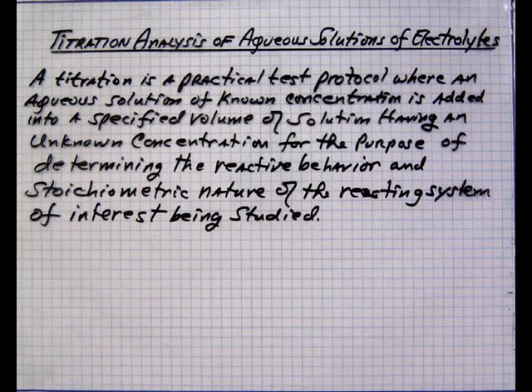Okay, this deals with the titration analysis of aqueous solutions of electrolytes. And a titration is a practical test protocol where an aqueous solution of known concentration is added into a specified volume of solution having an unknown concentration for the purpose of determining the reactive behavior and/or stoichiometric nature of the reacting system of interest being studied.